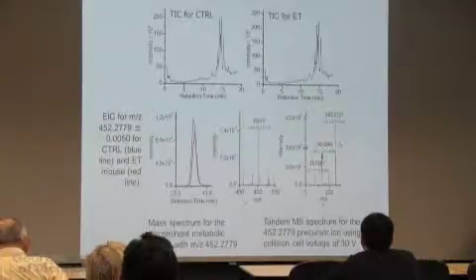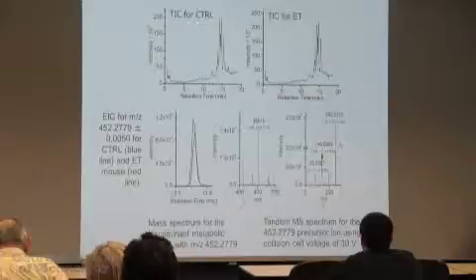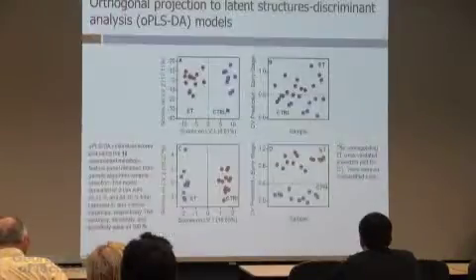So this is, if you've taken an organic chemistry class, you go back to your organic chemistry class. You look at your chromatograms. This is one for a control sample. This is one for an early stage sample. And it would be very tempting to start to look at peaks and small differences, but careful because you're not just interested in differences. You're interested in differences that are correlated with early stage cancer. There could be many differences, okay, between these mice, but you just want to look at the main differences.